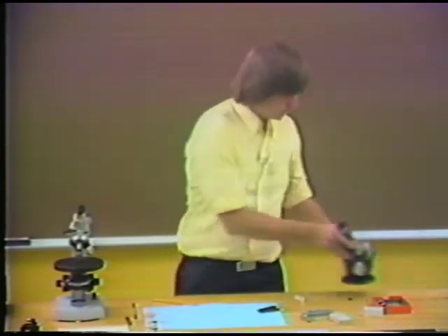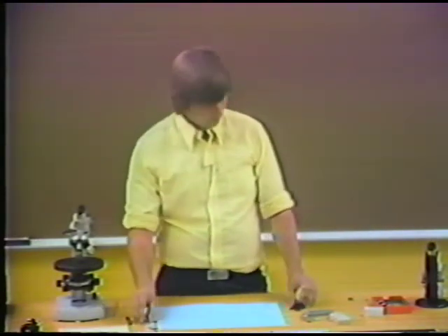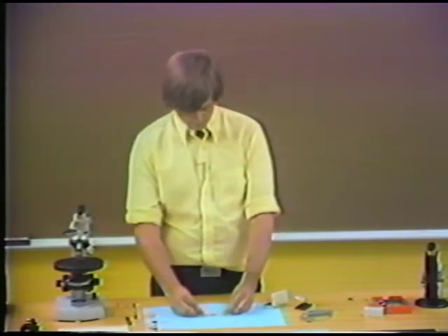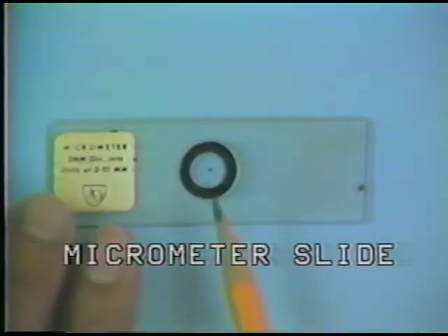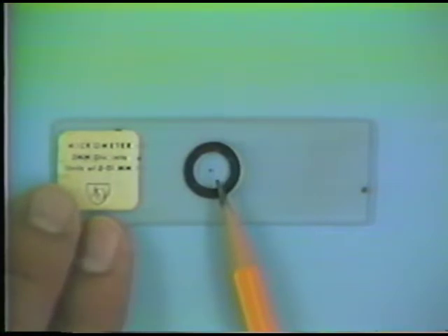Okay, well, let's do a few simple optical tests now with our microscope. The first thing I want to do is to calibrate the field of view. In order to do this, I'm going to use a special preparation called a micrometer slide. This micrometer slide, you can't see this, but there are very small graduations, 2 millimeter long graduations at 1/100th of a millimeter, in the middle of this slide.